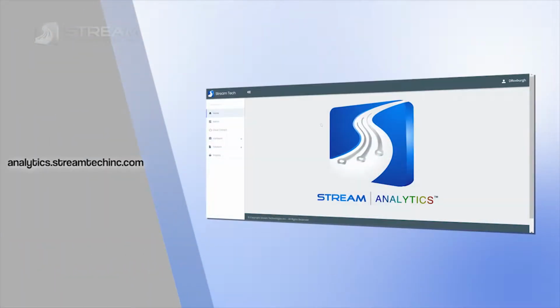First thing to do is to register your device to your company on the Stream Analytics website.